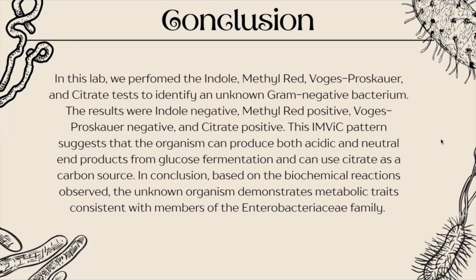In conclusion, based on the biochemical reactions observed, the unknown organism demonstrates metabolic traits consistent with members of the Enterobacteriaceae family.